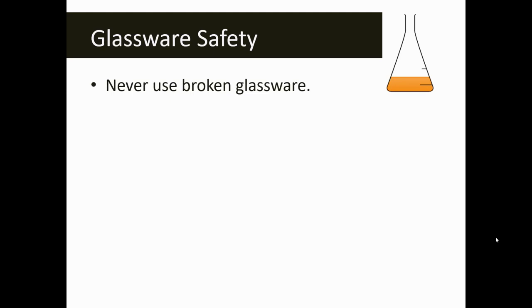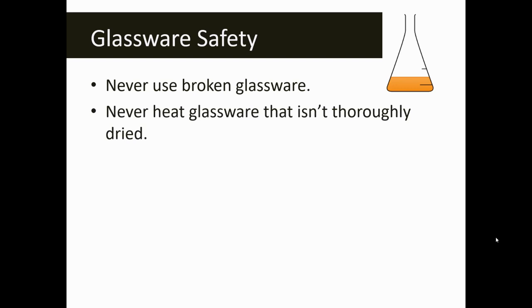A couple of rules of thumb when we're using glassware: we always want to inspect the glassware prior to use. If anything is chipped or broken, you don't want to use it. If you notice something is not right about the glassware or if it happens to break during the lab, you need to report that to the teacher immediately. You never want to heat glassware that's not thoroughly dried — if you put wet glassware on a hot plate, the glassware can actually move, and if it's filled with a boiling or very hot liquid, that could become a problem.